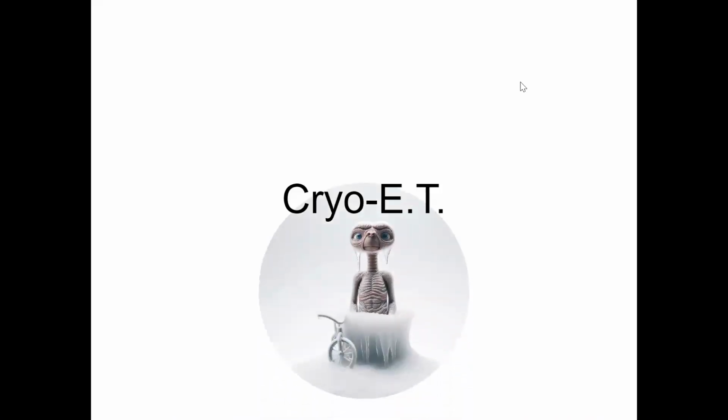What is Cryo-E.T? No, it's not a frozen ET. Cryo-E.T stands for Cryo-Electron Tomography. It is a biophysical technique used to study very small objects and their surroundings, such as proteins and other subcellular structures. How small are these structures?